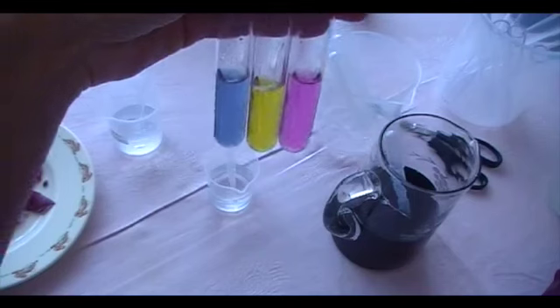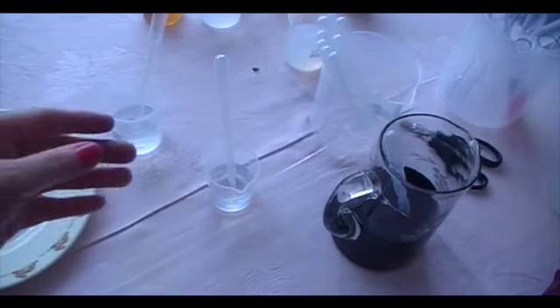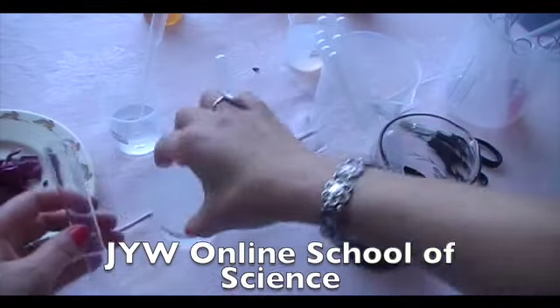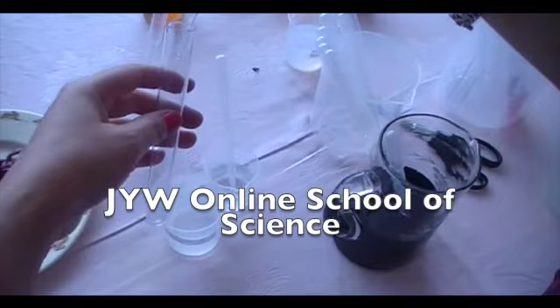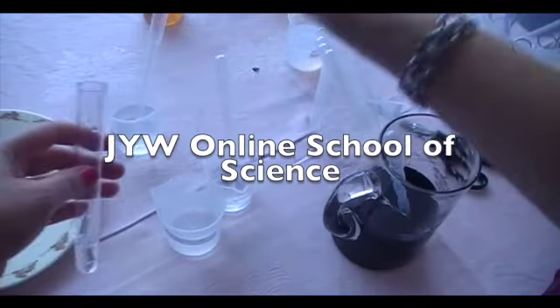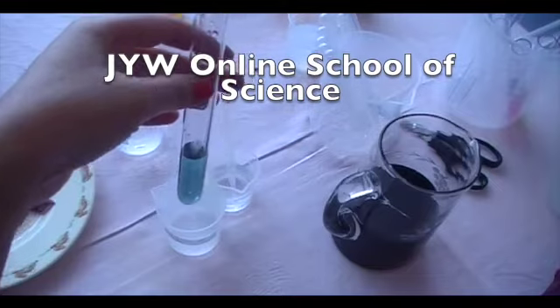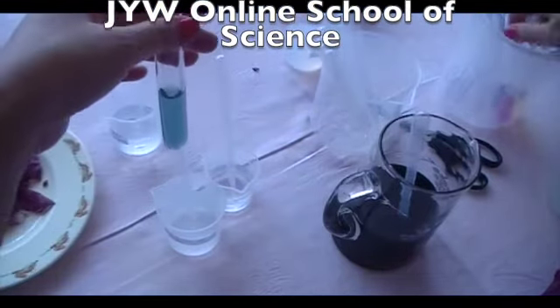Yeah, and I do that again. One more. Let's say this is soda, bicarbonate of soda, and add a bit of soda solution. Then see what color that would be.